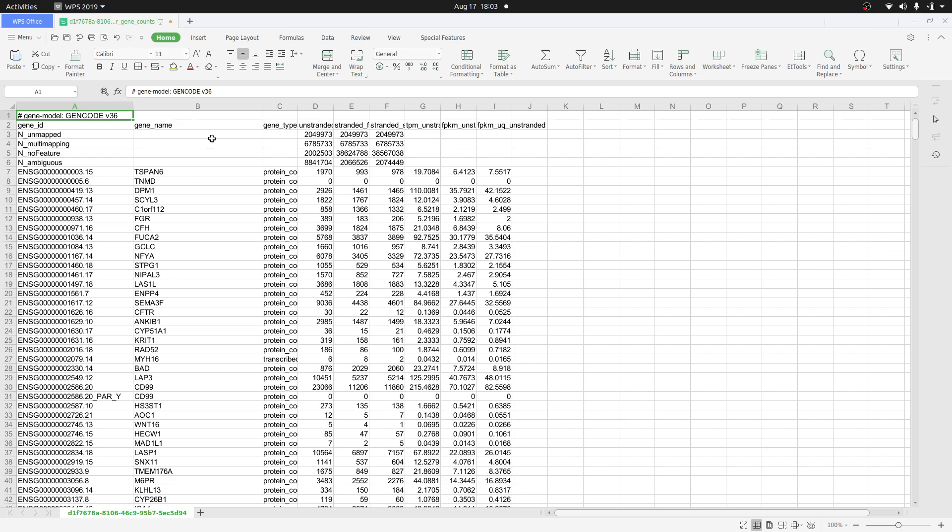Now that's the counts. You will have to decide the information you want - that one I'll leave up to you. This is gene expression data, STAR counts, meaning read counts.